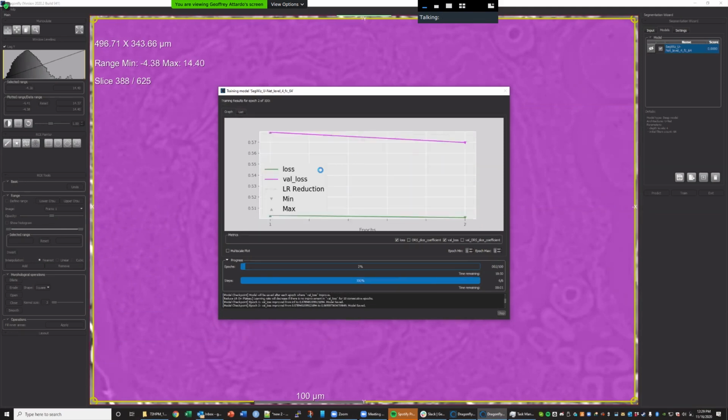Okay. Yeah, it's moving much faster now. Yep, it's much smaller, and I used the bigger patch size, and that should be important for your data set. Yeah.